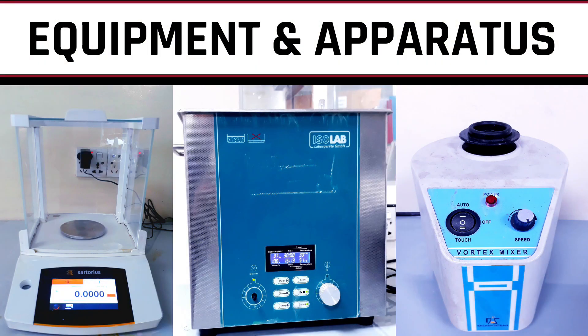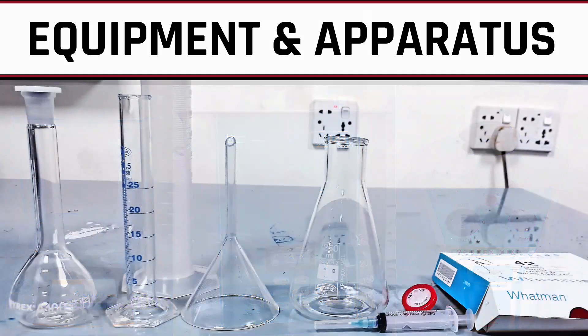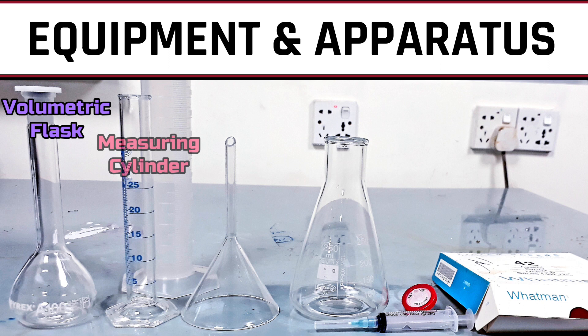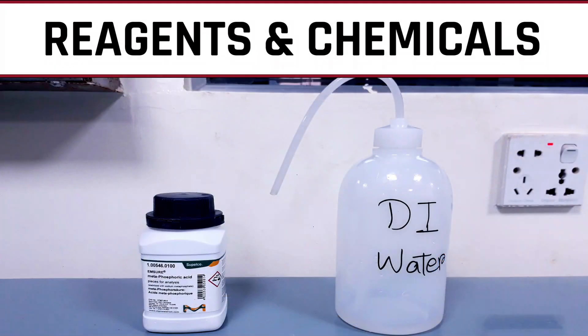For this procedure, we need a balance, a sonicator bath, a vortex mixer, a volumetric flask, a measuring cylinder, a funnel, a conical flask, a syringe with filter, Whatman filter paper, metaphosphoric acid, and deionized water.